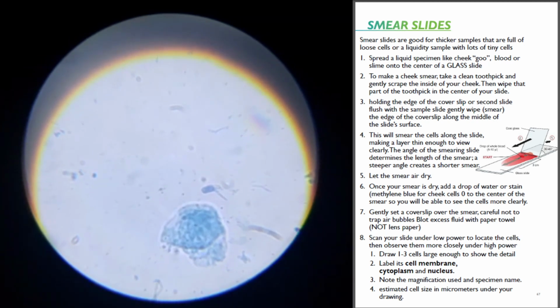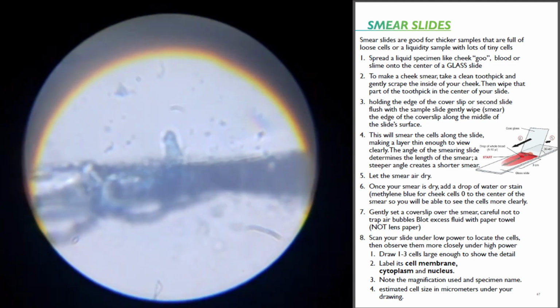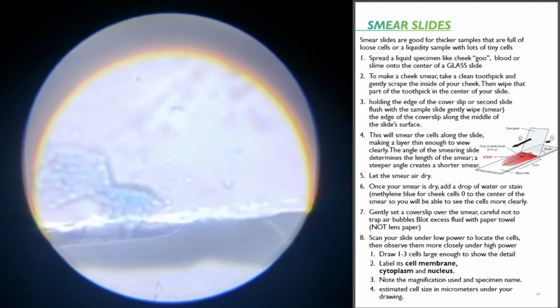Well, let's move on to the next cluster, see if we can find it. There's the edge of the glass, and it's a nice group.